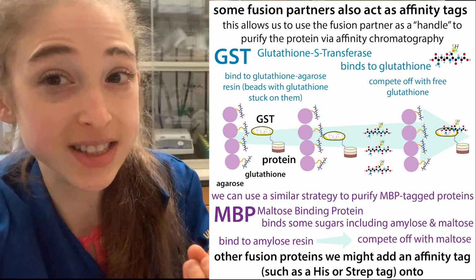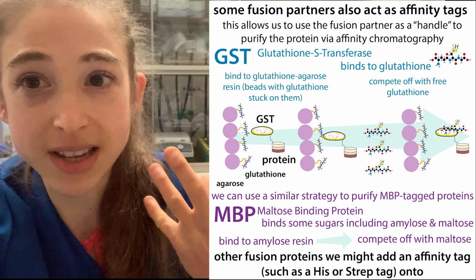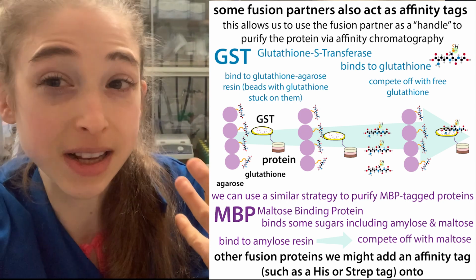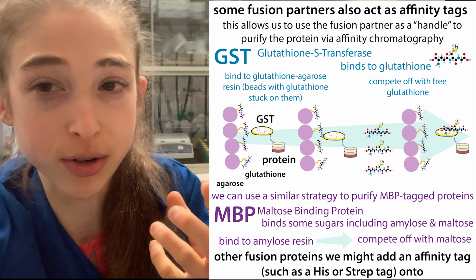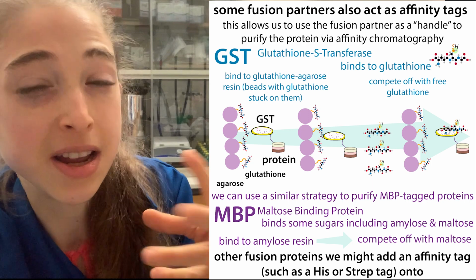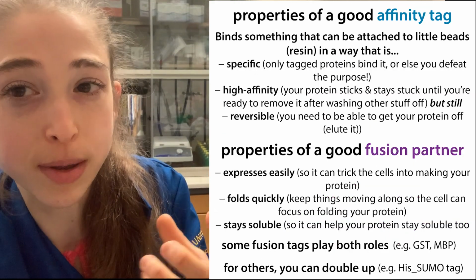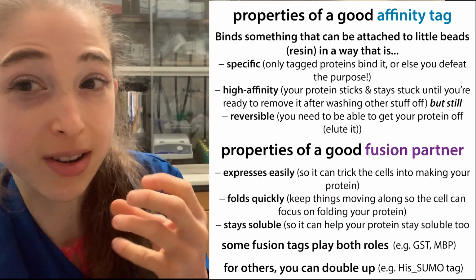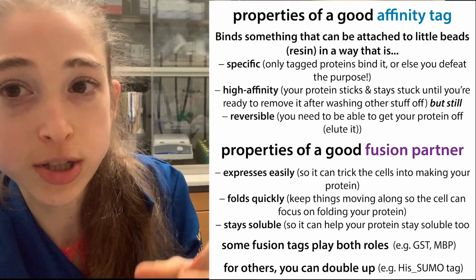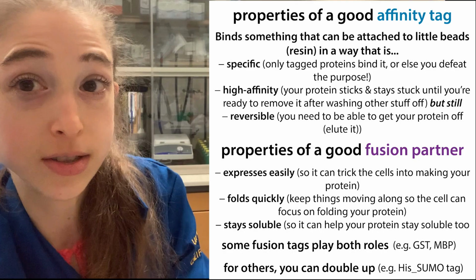Some of them, like GST and MBP, actually can be used to purify them as well. They can serve as affinity tags. We can use glutathione or amylose resin to purify them. But they have some problems, like they dimerize and things like this. I prefer SUMO. I'll tell you a little bit more about all of these, but SUMO also has this cool thing where it has a specific protease that'll cut it off. And so much more about these and other topics, so let's dive in.